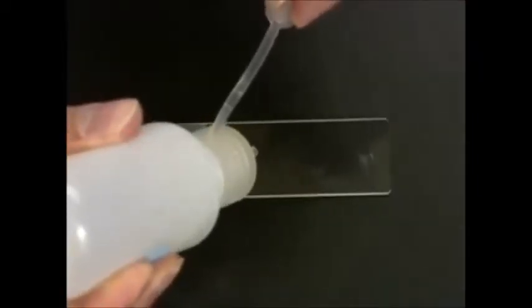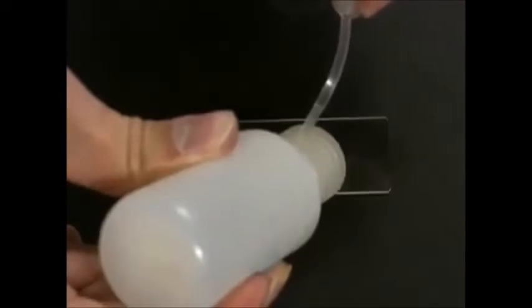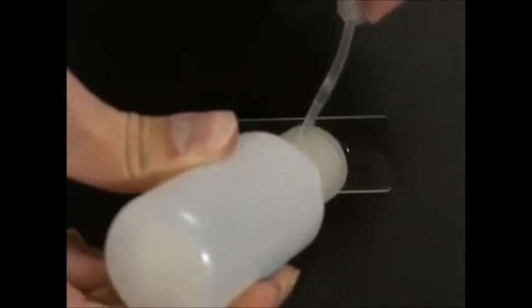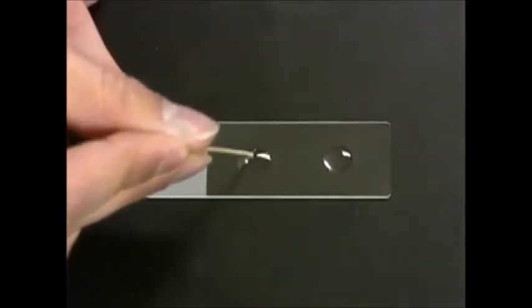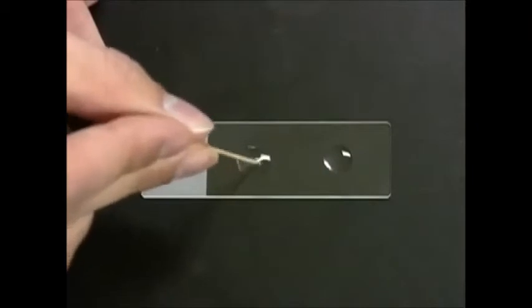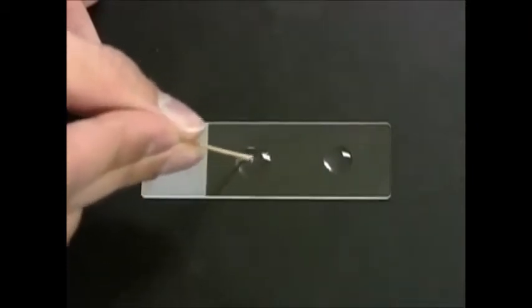Let's take a closer look. First, we will add our Staphylococcus epidermidis. Notice the bubbles forming.